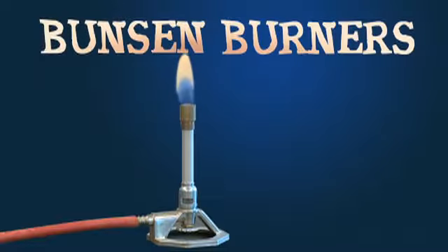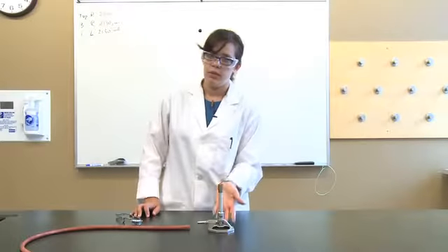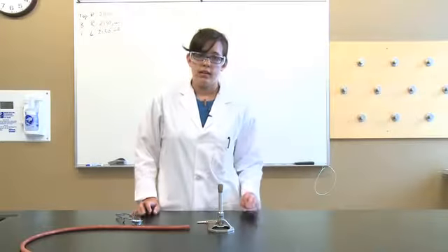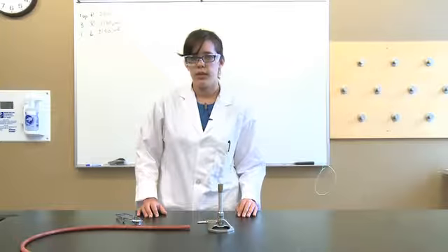In this video, you're going to learn how to use a Bunsen burner safely and properly. This is a Bunsen burner. It allows you to heat materials in the lab both quickly and efficiently.